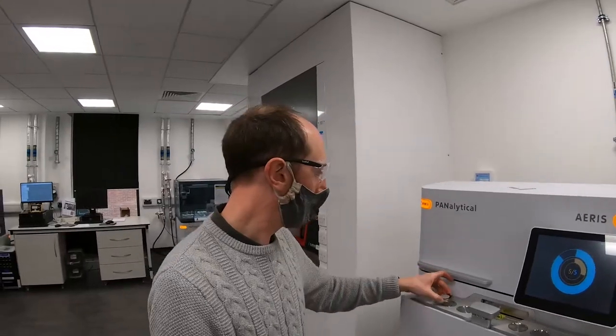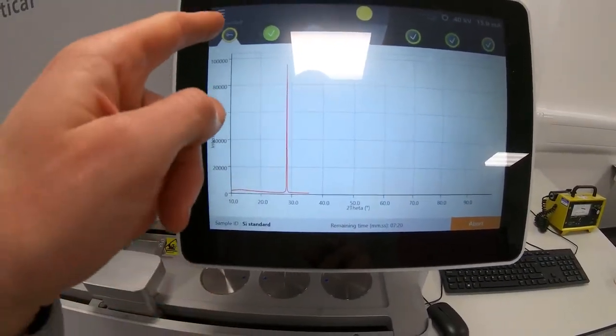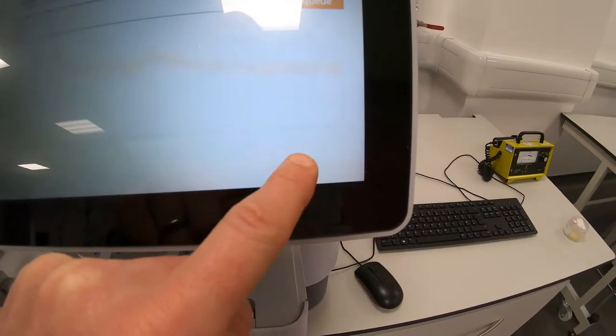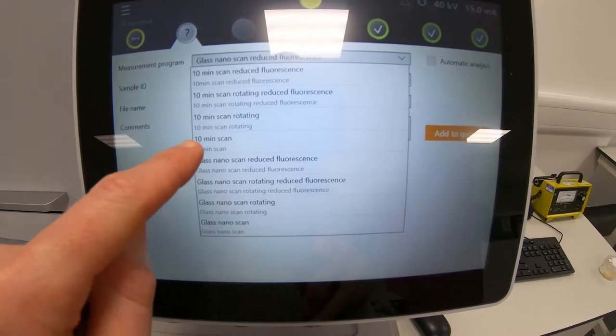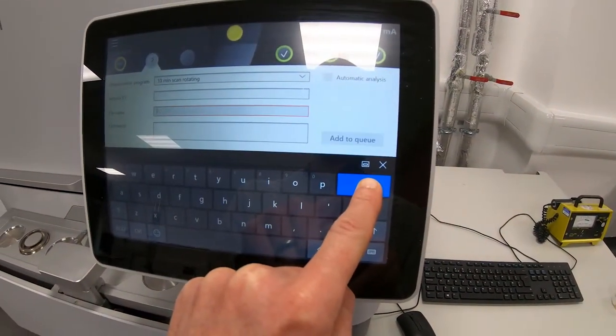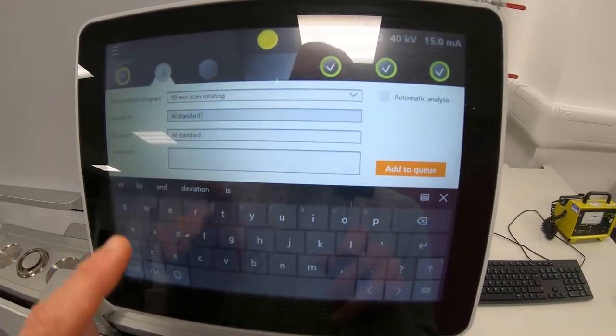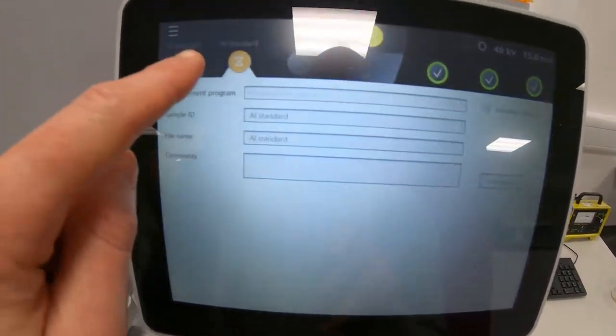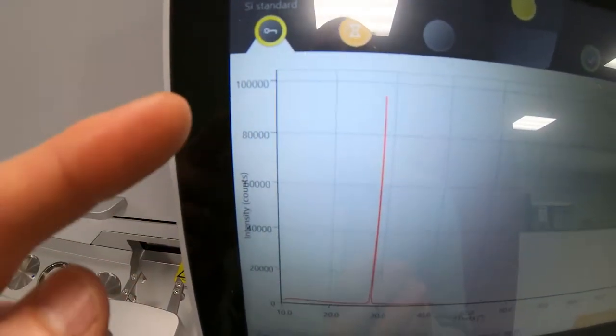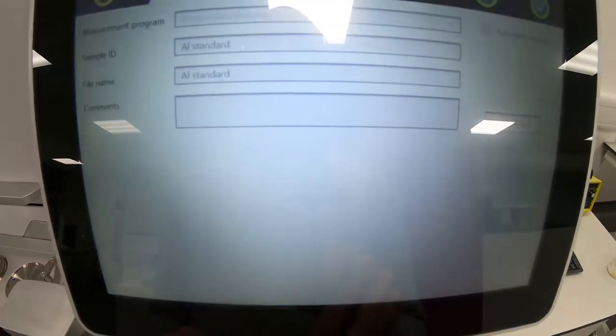So if you had another sample that you wanted to run whilst the machine is running, you can simply add that. I've got another sample here, I put it into position just as before. I'm going to go to the touch screen. You can see that the data is being collected now on sample one. This lock here, that's the sample that's in. Now I'm going to press sample two. You can see the old data, so go to next measurement. I can add that in. I'll just add a 10 minute rotating scan. Somebody's got some data here in the file name, so I'm going to delete that. Add my file name: Aluminium standard. I press add to queue. You can see now this has turned into a little timer symbol. That means that the next one that's going to be run will be the sample here. Once our data finishes collecting here, it'll start to run the Aluminium standard, and you can see the file names just there at the top.